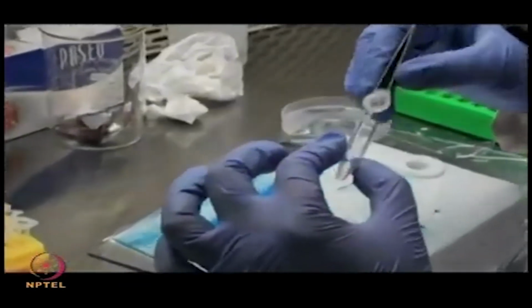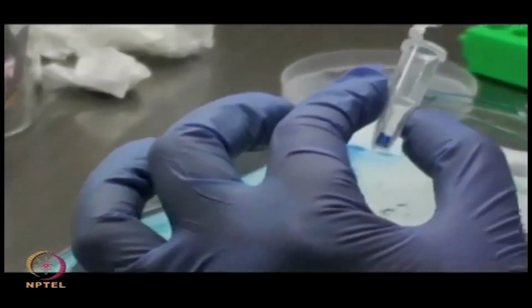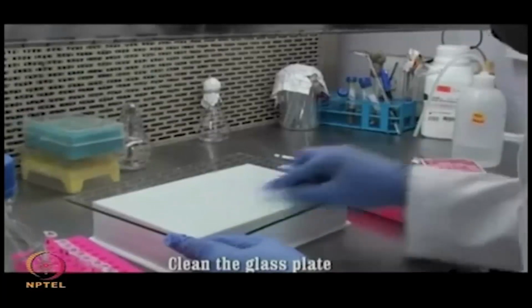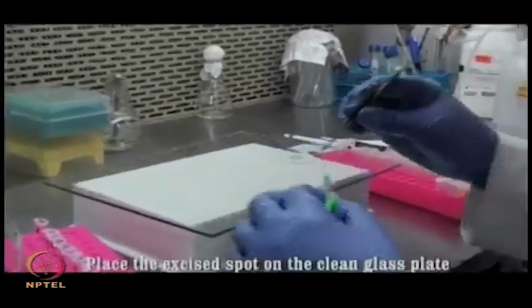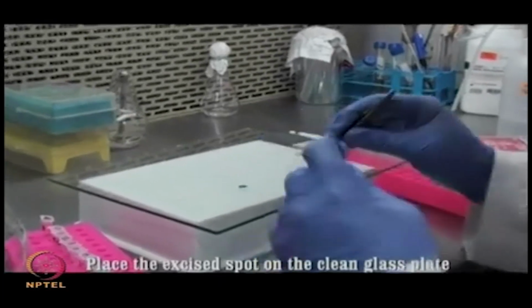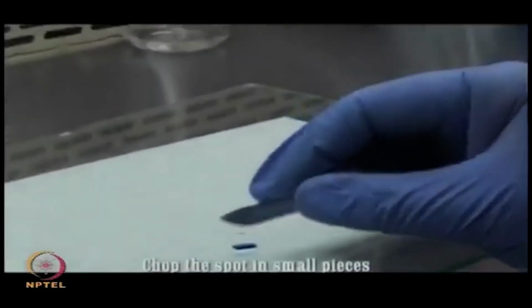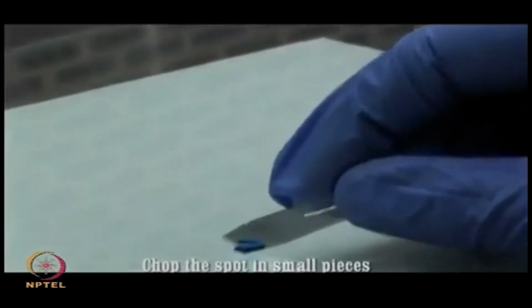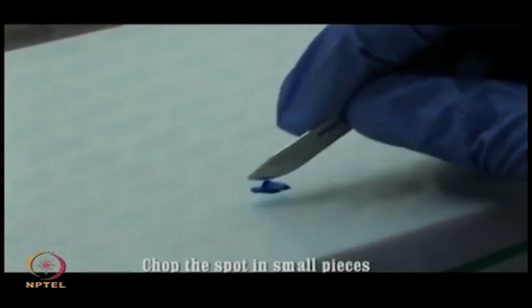It is possible you have excised a large spot or large band, then cut the slice into cubes while avoiding too small pieces as they can clog the pipette tips. So, this is the larger spot. You cannot directly take this one for doing the in-gel digestion. So, you need to excise that into small cubes.